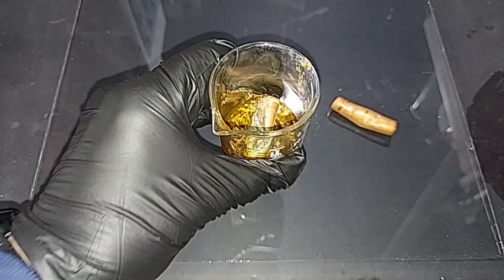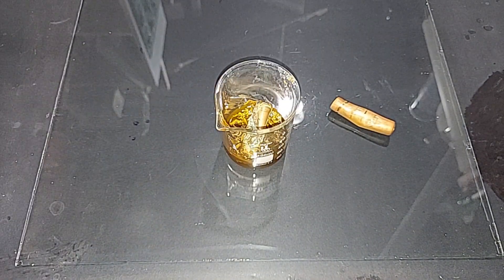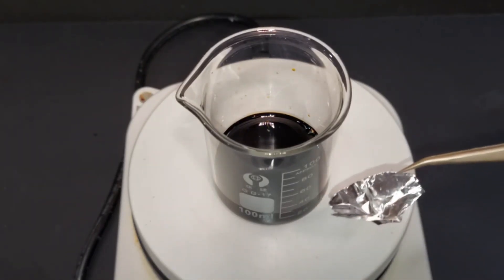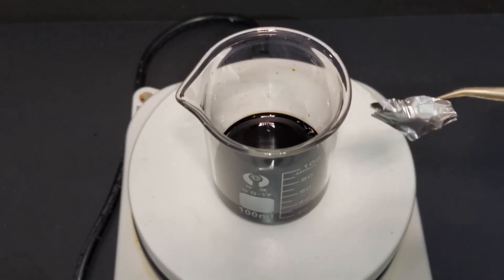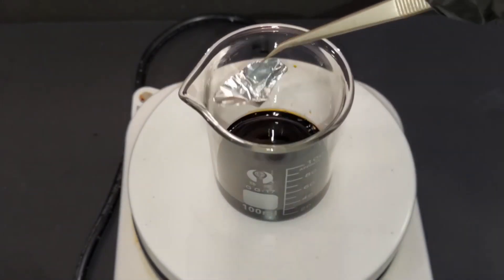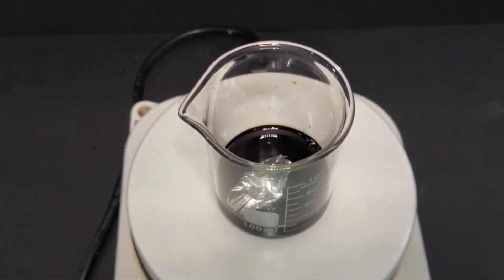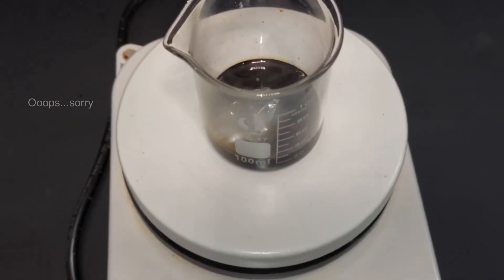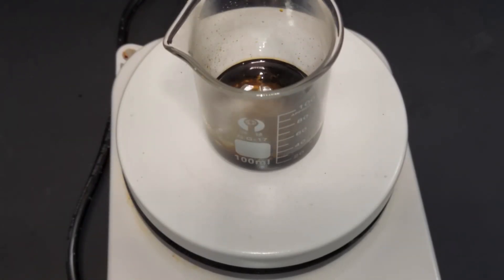Now with 30 milliliters of fresh ferric chloride from the original set-aside batch, I've made a small aluminum foil boat and I'm dropping it into the ferric chloride. The aluminum reacts vigorously — it dissolves rapidly. As we saw: don't build your boats out of aluminum in an ocean of ferric chloride.